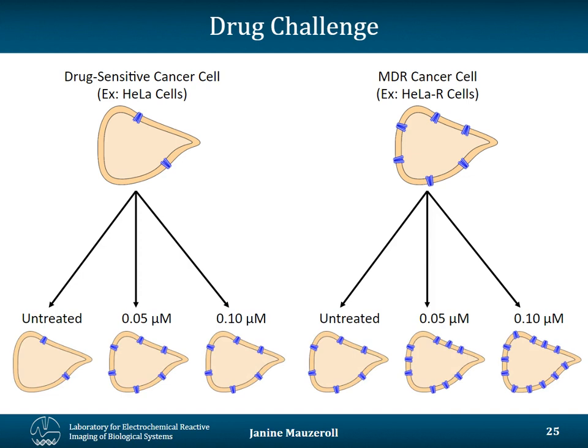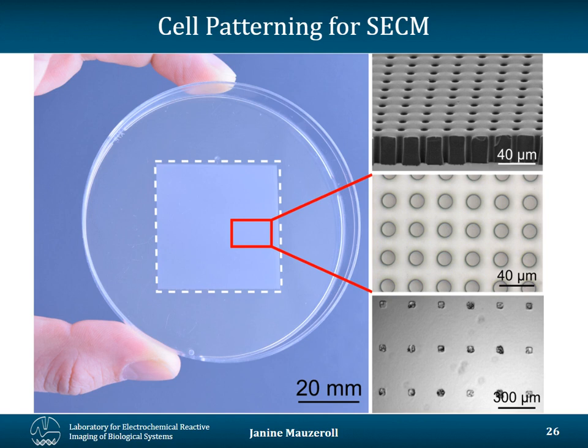As we discussed, SECM is a surface-based technique. And so many people that work with live cells rely on a soft lithography strategy where they will be able to pattern their cells. In this case, I'm showing you the protocol that we use in our labs, but there are people that also use conical vials or conical miniaturized dishes. And so there's a lot of activity in this field as well. So you pattern the cells.